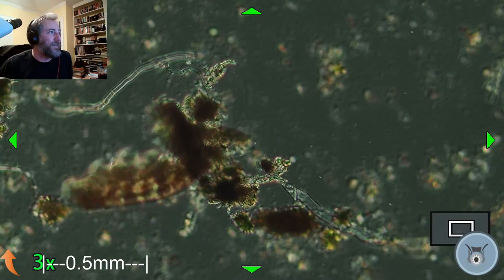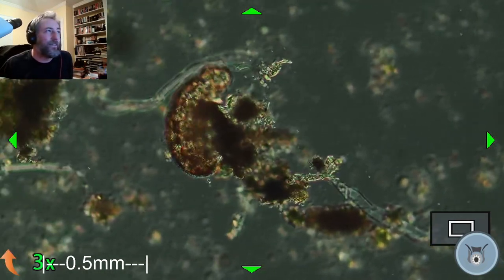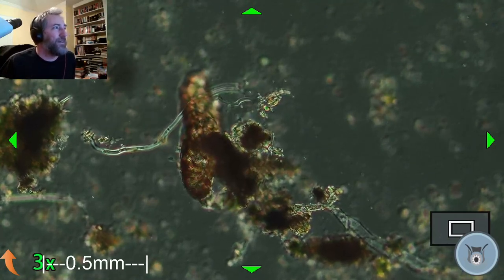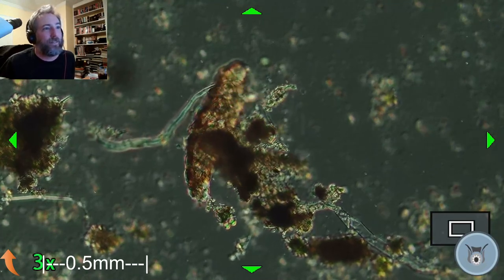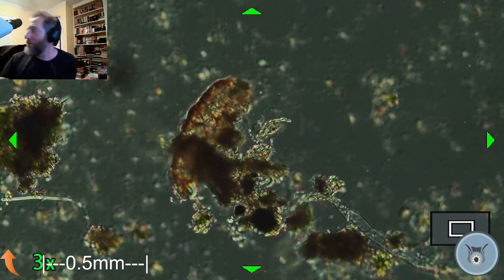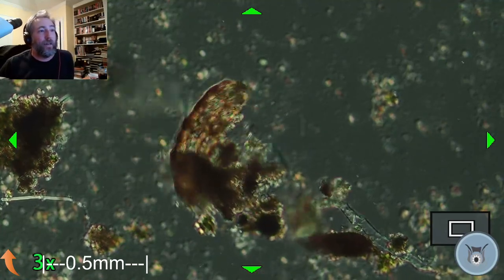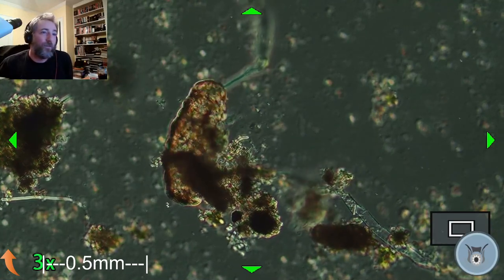By looking very critically at it. And it's an old lake, so it actually is likely to have more than that. But think of all the lakes that we haven't looked in, and all of the places where we haven't looked for many of these things. They're probably pretty underexplored. And there's a pretty large bias in science towards larger organisms.